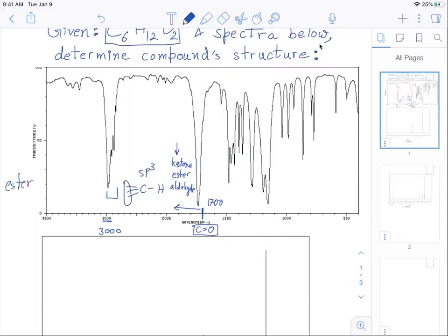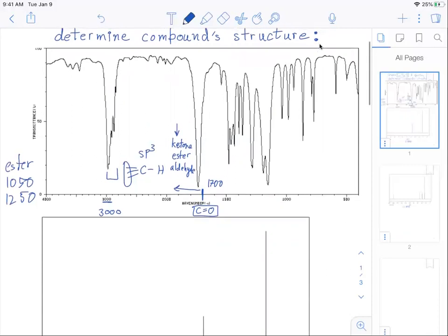Ester on the other hand, for ester we go looking for 1050 and 1250 and this is not an exact science. Anything in that general area means you have hope. So don't rule esters out easily. Same thing goes for aldehydes. For aldehydes we go looking for a twin peak around 2820 and 2720 and these are usually much clearer and easier to either find or rule out.